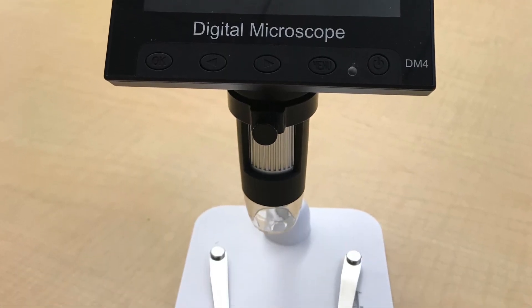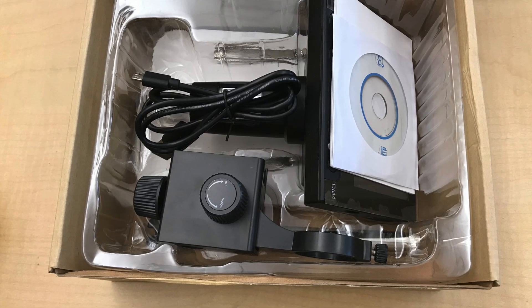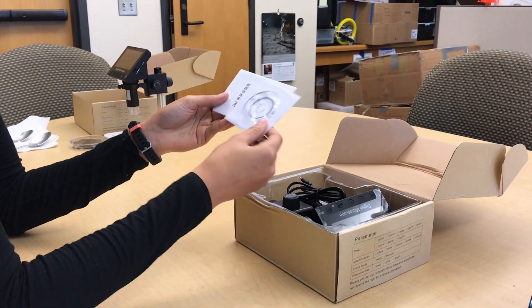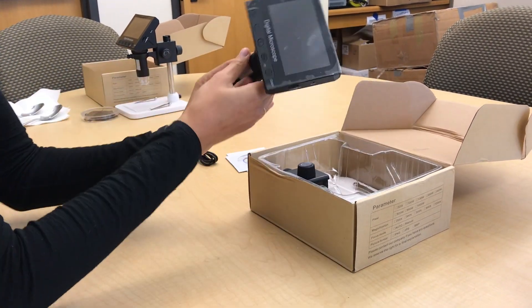We'll be using this portable digital microscope. This is what the components look like when you first open it up. It comes with an instruction manual and a CD with software on it for if your computer doesn't have a webcam.